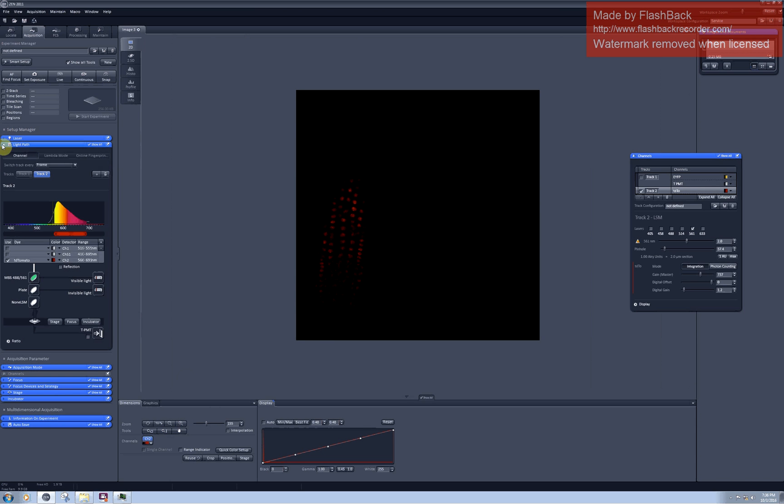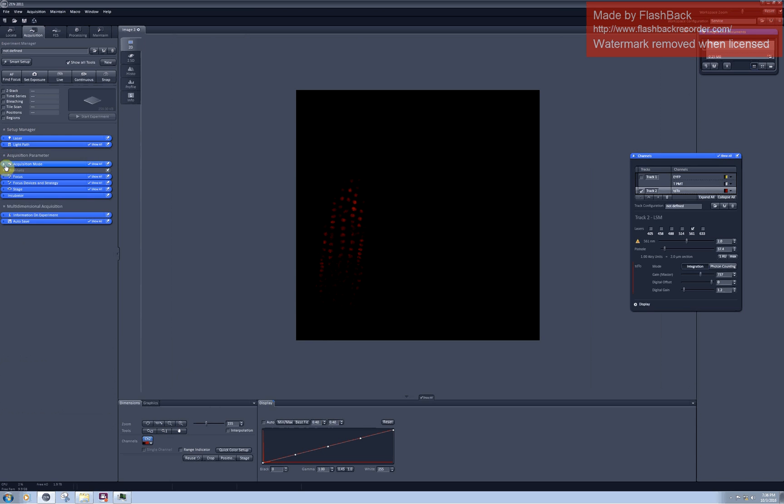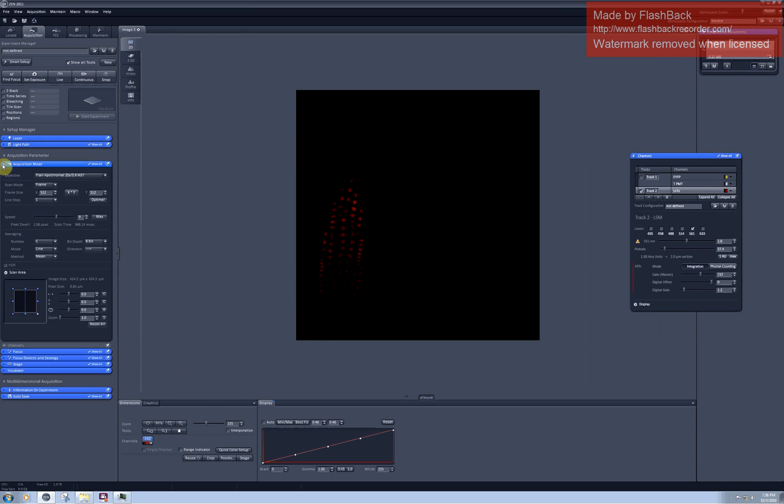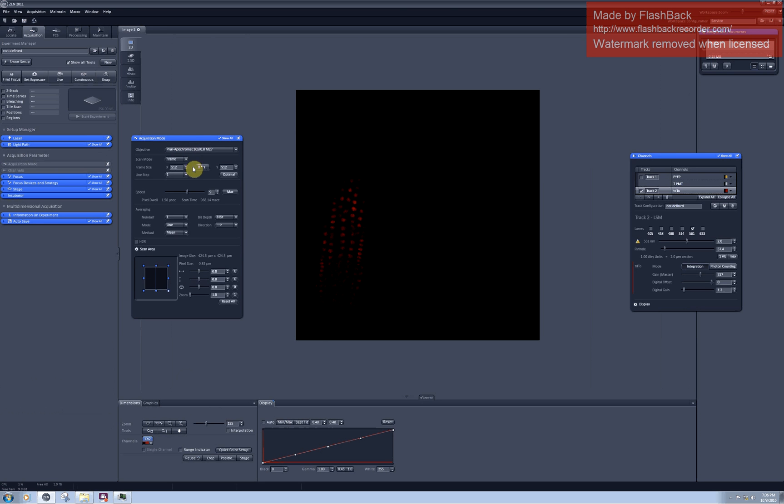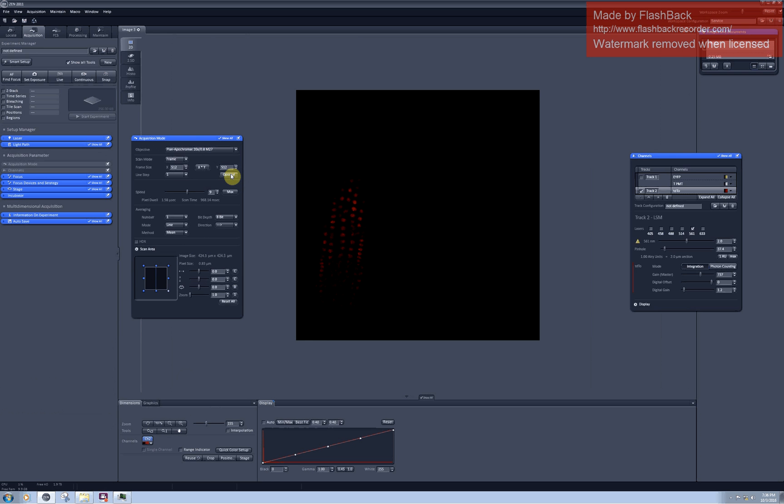To fix it you should go to the acquisition mode tab and here you can see that there is a wide choice of different resolutions including the optimal possible resolution which you can select by clicking on it.